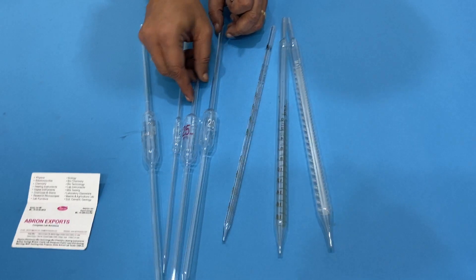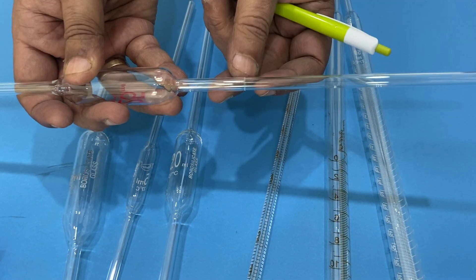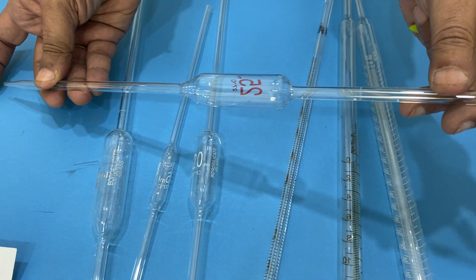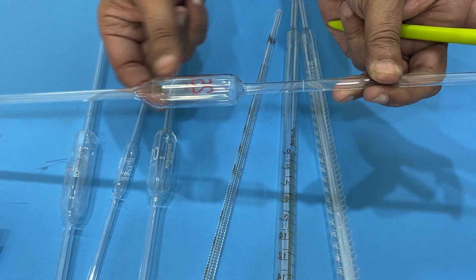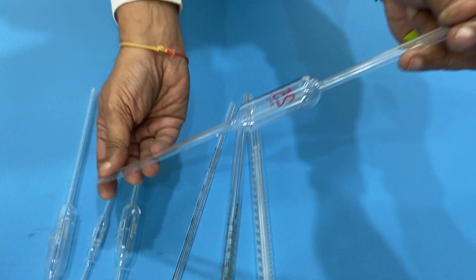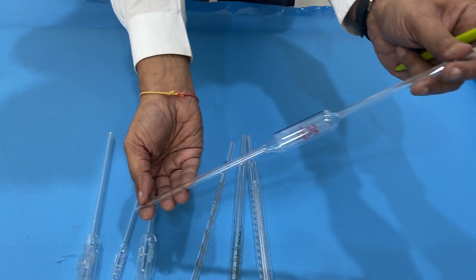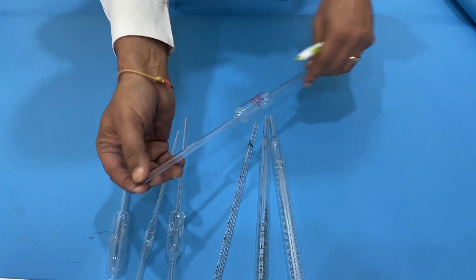It has two systems. Here it is — one line at the top, which marks the top volume. When you fill it, keep it pressed. Fill it using a bulb, with your mouth, or with some solution. Pour it out and the solution keeps coming out. When the last drop is just remaining inside, that is one complete 25ml.